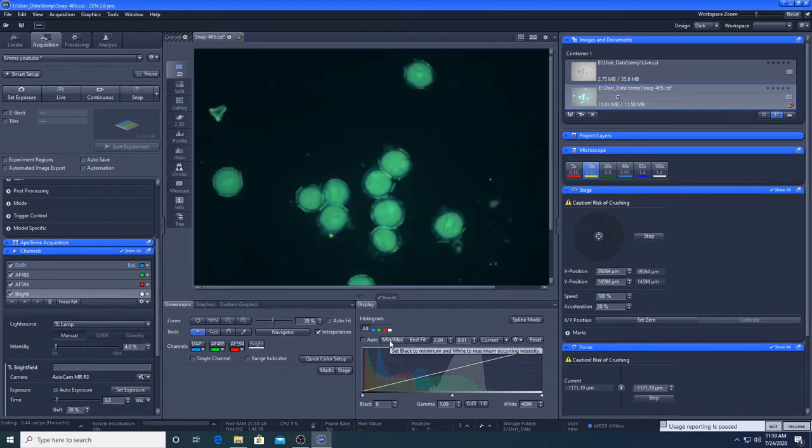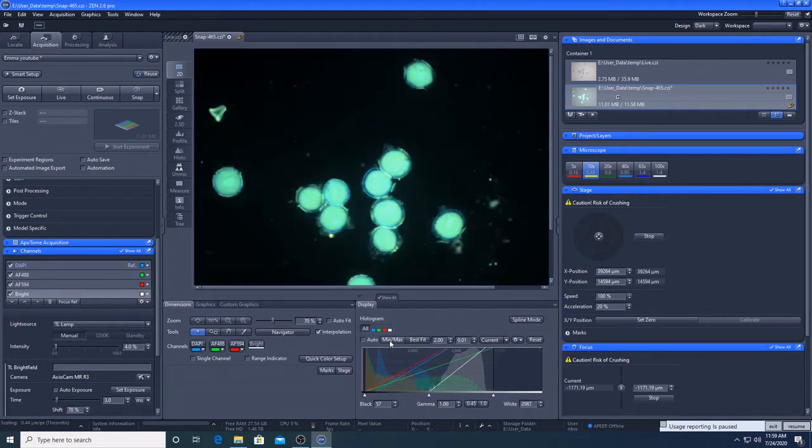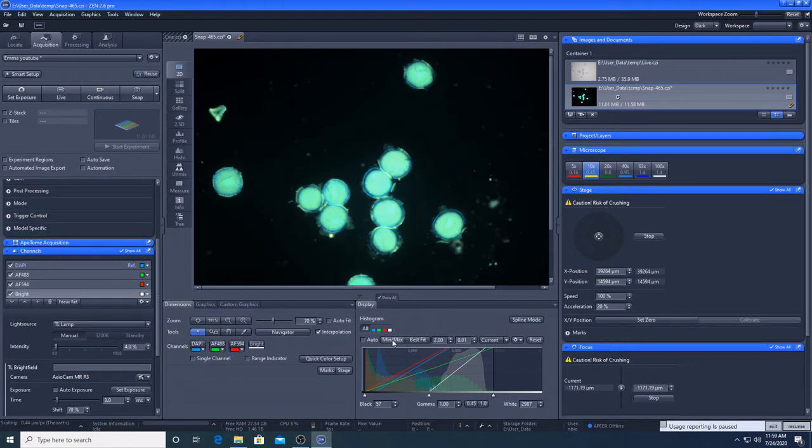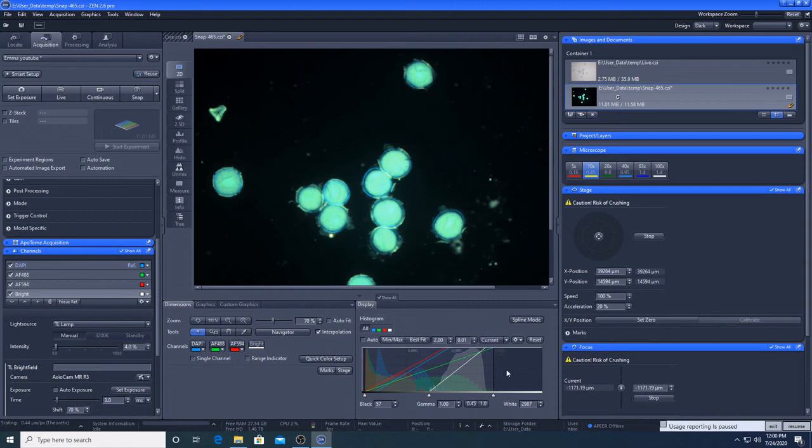To increase contrast, we can press min-max to change the way the image is displayed. If you are taking multiple images that you are intending to publish or present, you should set the display scales manually for each channel, and keep the channel settings the same across all of your images, so that you don't unintentionally misrepresent the differences between your images.